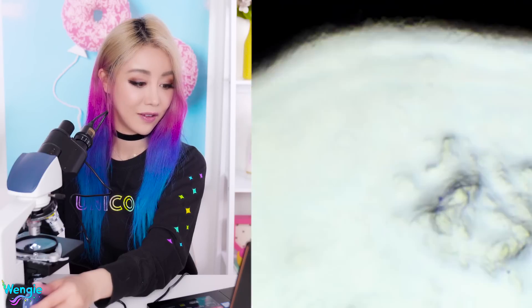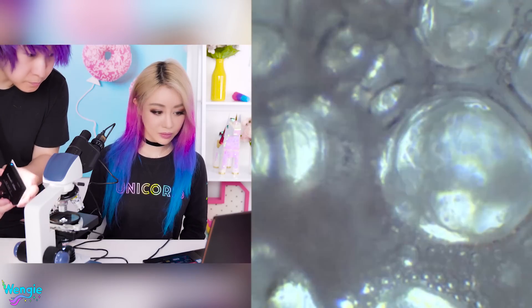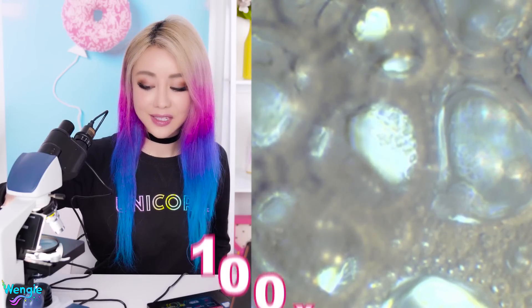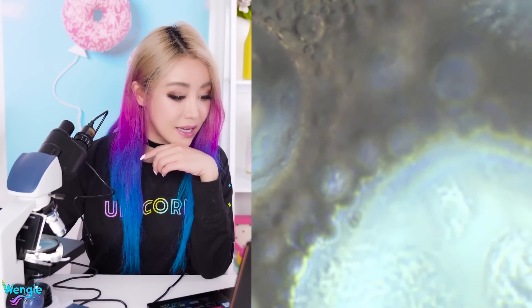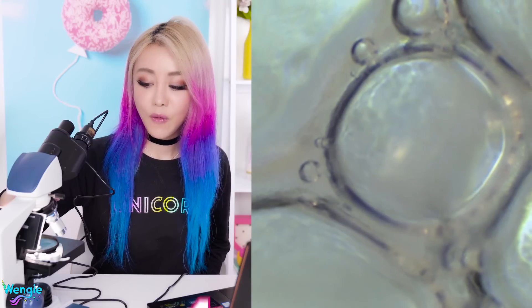There's the edge of the shaving foam — I have no idea what that is but it looks disgusting. This is the cute part. It's alive! So let's have a look at this at 100x. You can see the bubbles are a lot bigger. Look at that — that is one giant bubble. Now we can see tiny clear bubbles in between the giant bubbles that we didn't see before. It does not look as scary when it's not slime. Shaving foam itself is kind of gorgeous. Now let's look at it 400x.